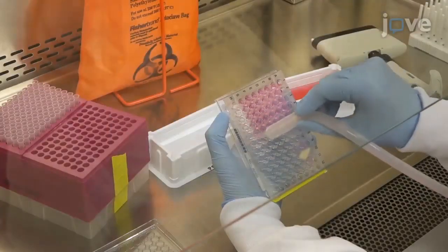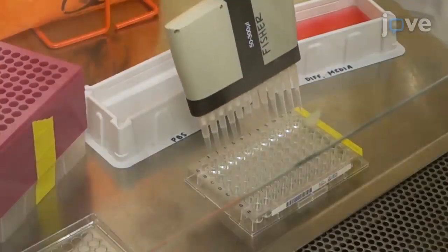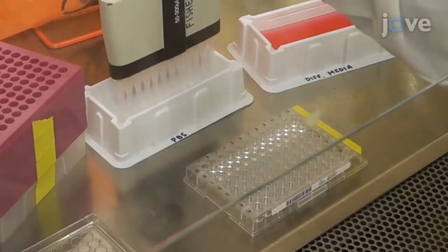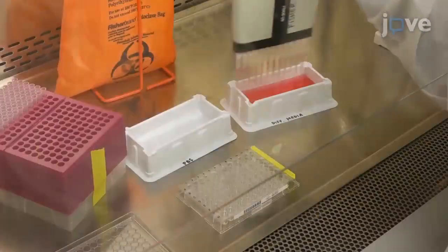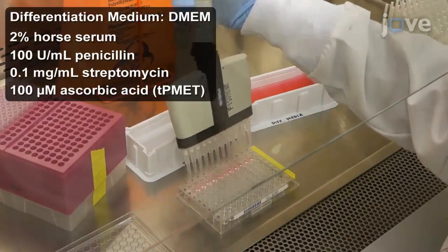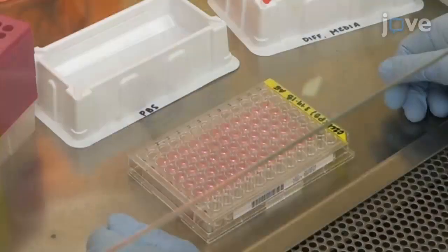After 24 hours in culture, aspirate the growth media, wash with 150 microliters of PBS, replace with differentiation medium, and incubate the cells for an additional 24 to 48 hours.